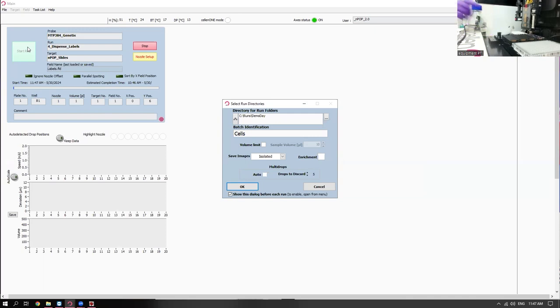So you would aspirate it just as though, so essentially it's the same protocol as the DMSO dispense, where you aspirate the trypsin from this position here. If you have just two slides, or actually for the plexDIA, one aspiration of 35 microliters is enough to dispense to all of the positions. You're only doing 13.5 nanoliters of the trypsin. For the TMT, it's two aspirations, one for the first two slides, the second one for the second two slides, just because it's more volume, more spots. So the trypsin is essentially a repeat of the DMSO with some slightly different stuff, but just very slightly.